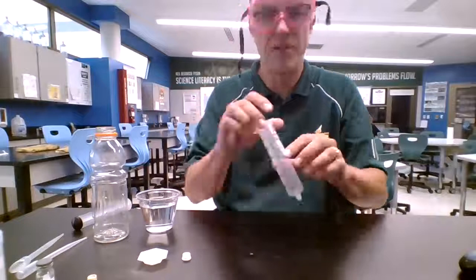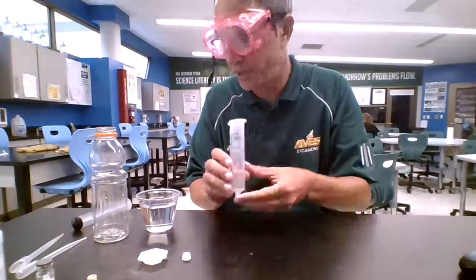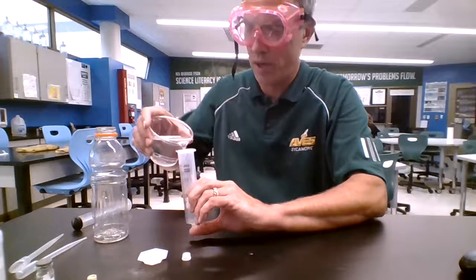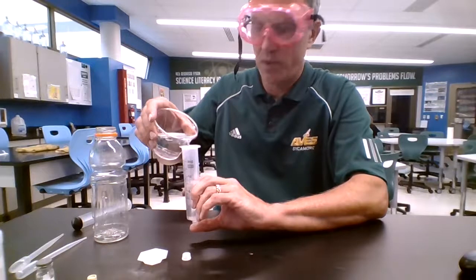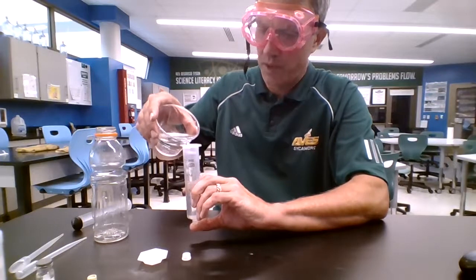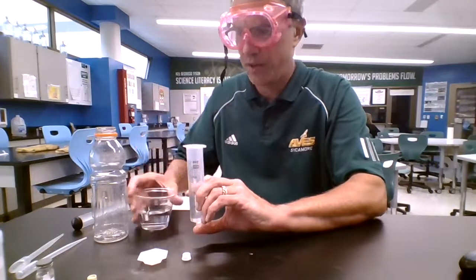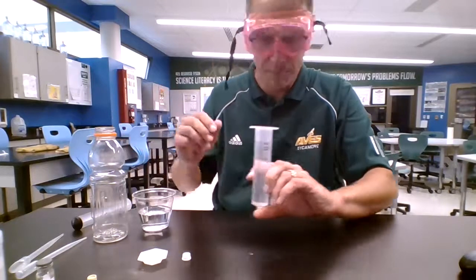First thing you want to do is take your syringe, which is completely empty, and I'm basically going to put my thumb over it, pour it filled with water. Okay, so we want to fill all the way to the very top of the water. Okay, very tippy top.